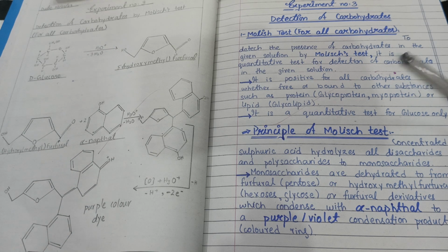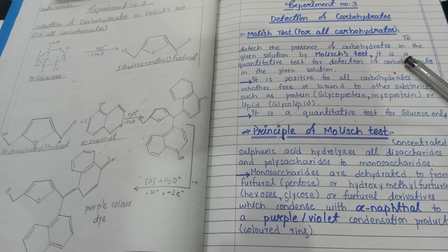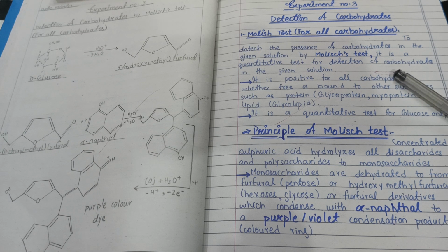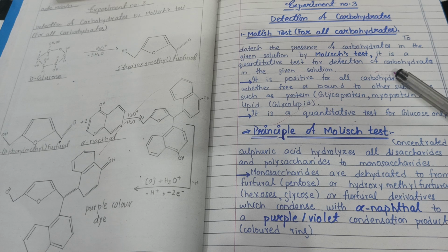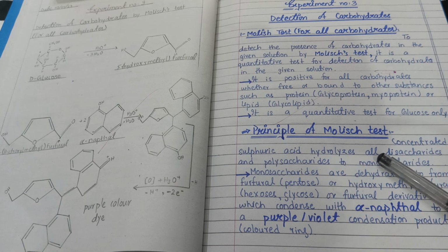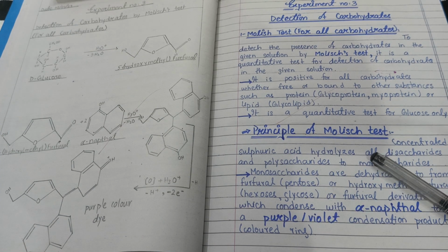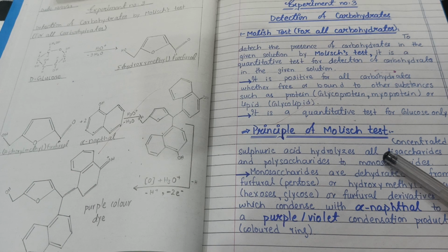In the start, they say that to detect the presence of carbohydrates in the given solution, you are going to perform the Molisch test. And the Molisch test is going to detect all of the sugars, whether it is a monosaccharide or a disaccharide, whether it is an aldehyde or a ketone, it doesn't matter. It detects whether the solution contains carbohydrate or not.